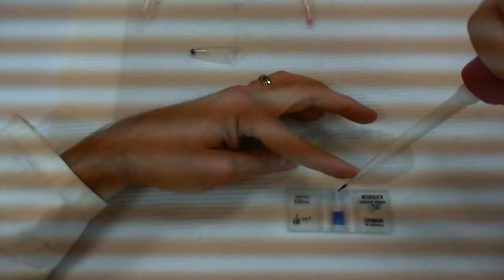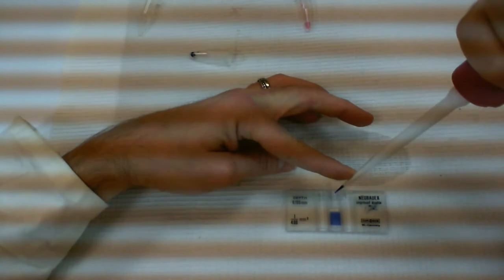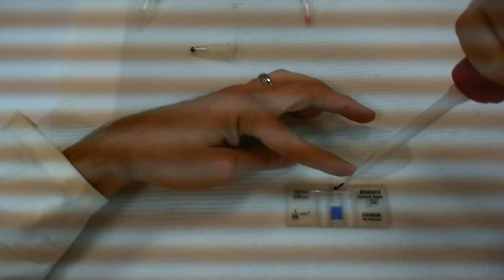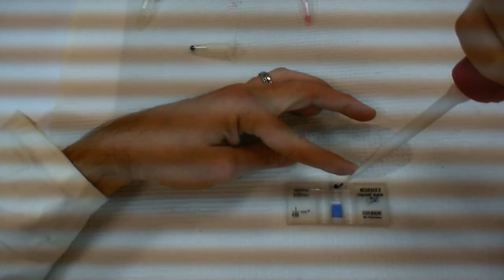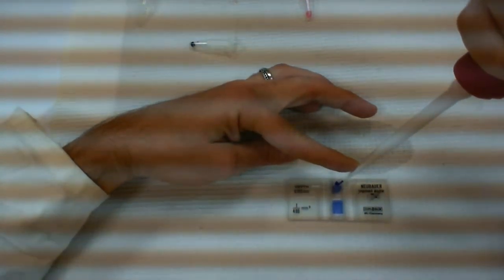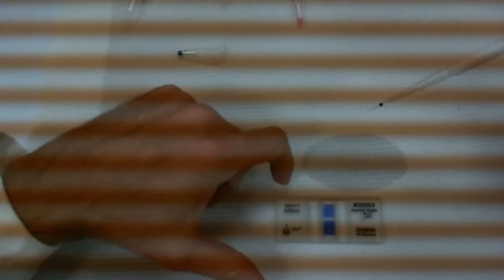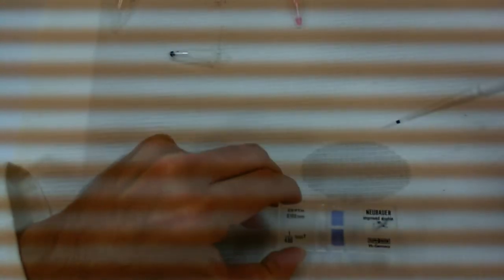Okay, so next to the cover slip here. And I'm not still far. Oh, there it is. Okay, now I can stop. Okay, so here we have two counting chambers filled. They're ready to be looked at under the microscope.